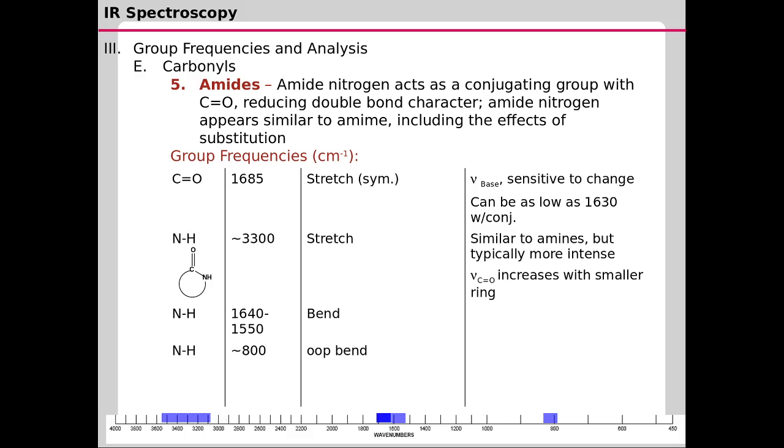The NH stretching frequency of the amide system usually appears at around 3300 cm⁻¹, and this higher frequency is due to the lighter atom hydrogen. When we have lighter atoms such as hydrogen in the bond, we have a low reduced mass, which results in a higher stretching frequency.